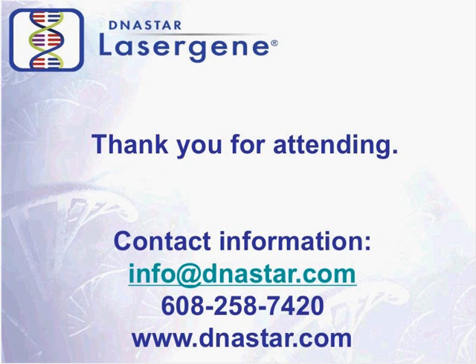Do these updates get maintained in GenBank or only privately is the question. This is an ongoing headache for this particular group. A recent bacterial genome submission took over 3 months to get deposited into GenBank. Well, I will take that one. I would say that, yeah, maybe it takes you a little bit of time to get into GenBank.